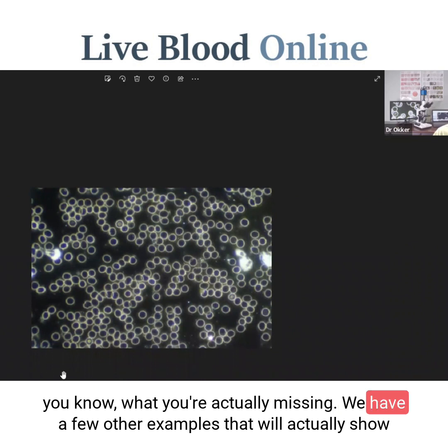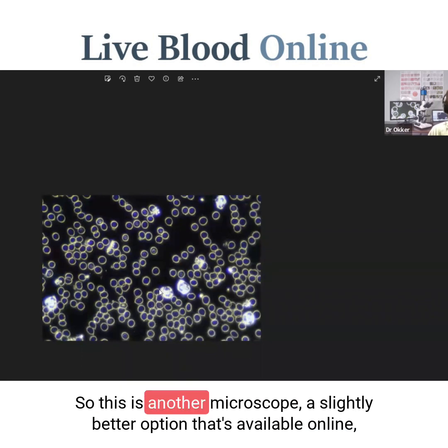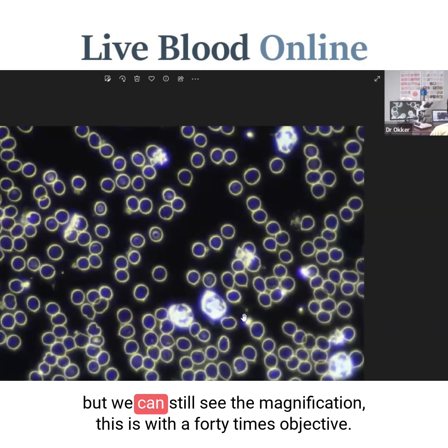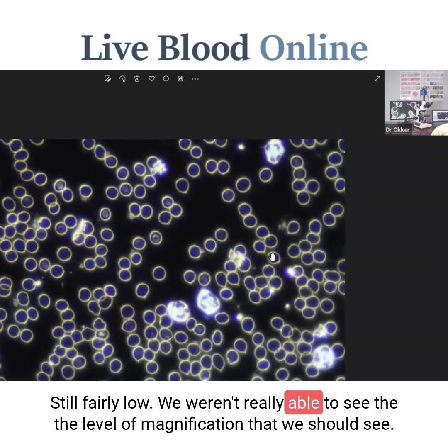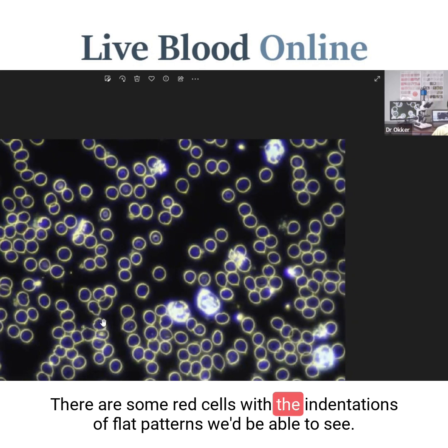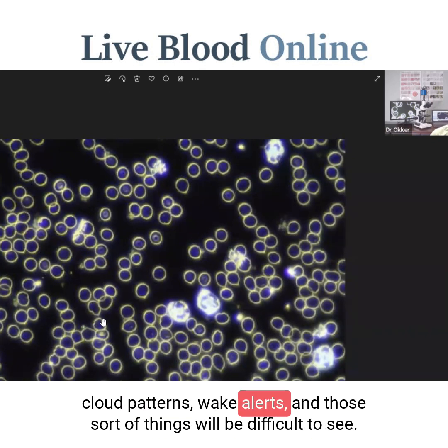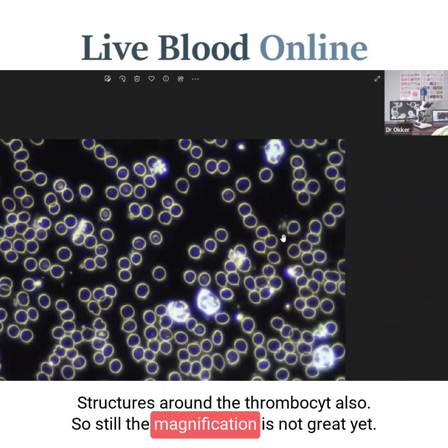Here's another example — a slightly better option available online. With the 40 times objective, the magnification is still fairly low. We will be able to identify some red blood anomalies; there are some red cells with indentation, so cloud patterns we'd be able to see at this magnification. But it would be difficult to tell some anomalies apart — cloud patterns, burr cells, and those sorts of things would be difficult to distinguish, along with structures around the thrombocytes. So the magnification is still not great here.